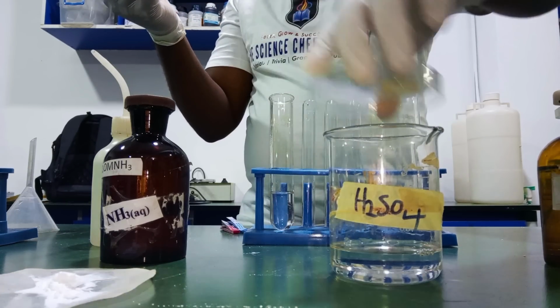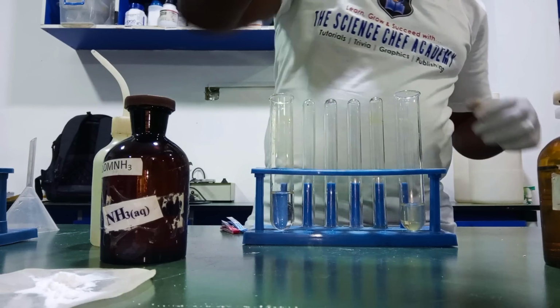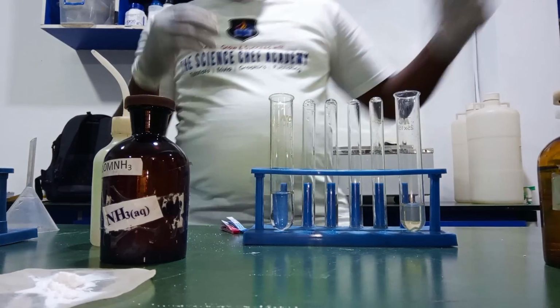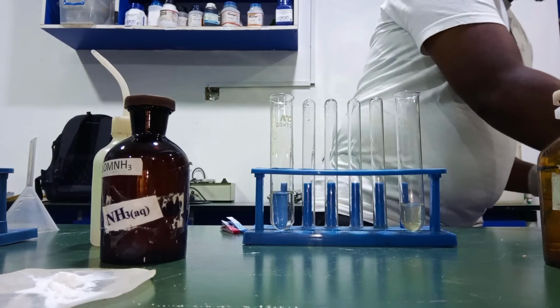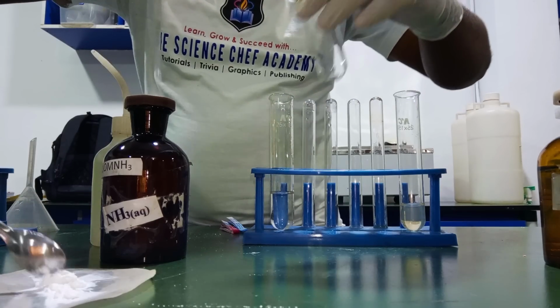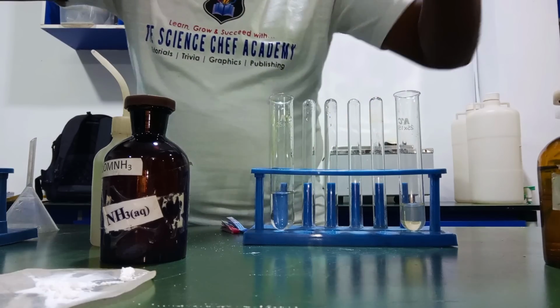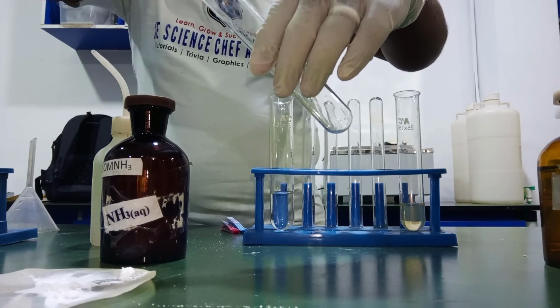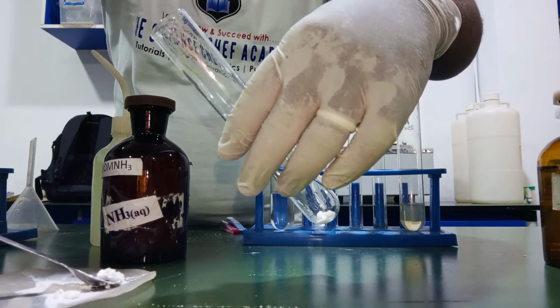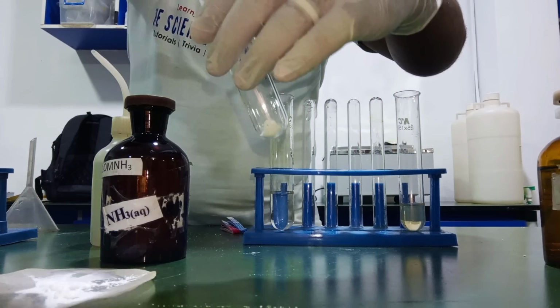So we are done with our concentrated acid. So for our residue, we are going to dissolve a part of our residue by adding dilute HNO3 to our residue in a boiling tube.